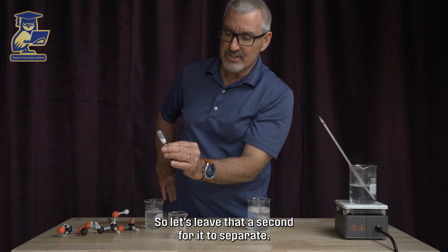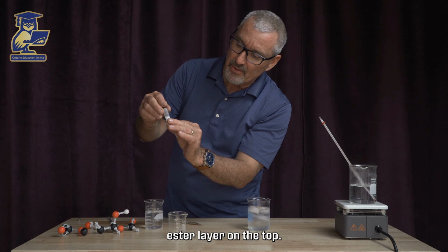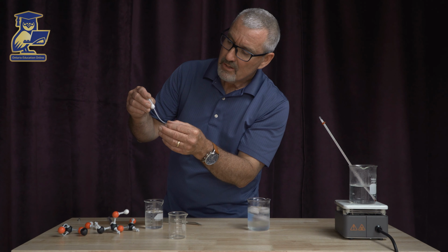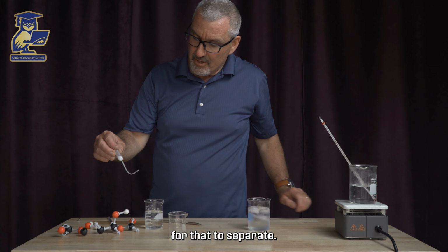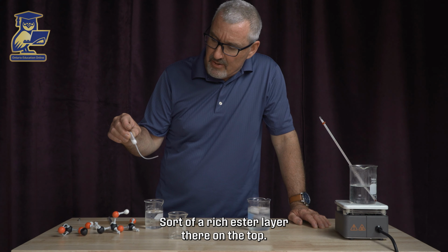So let's leave that a second for it to separate. And we can see we're getting a nice ester layer on the top. We'll leave a second for that to separate. Sort of a rich ester layer there on the top.